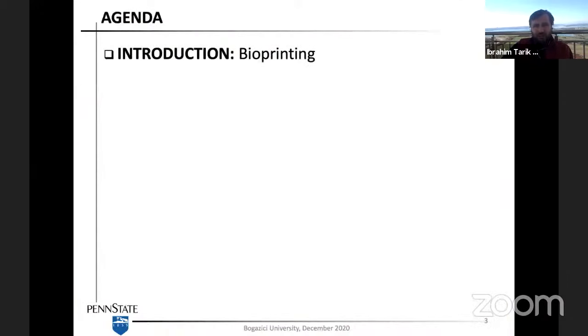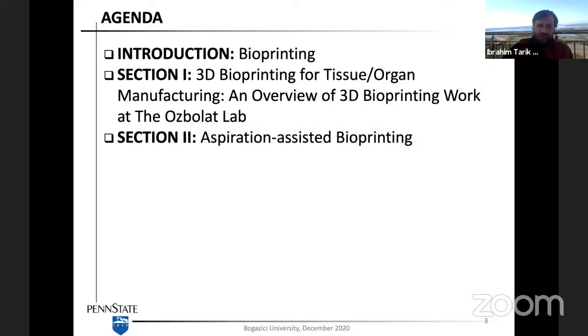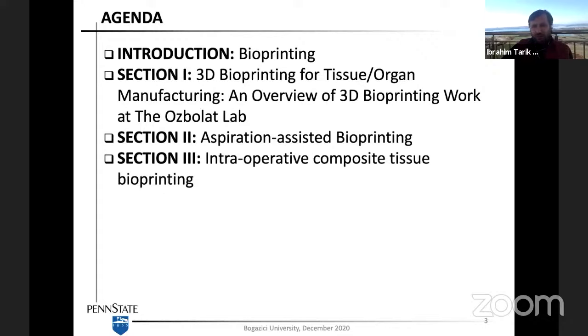So today, here is the agenda for my talk. I'll start with bioprinting, with a very brief introduction. Then I'll talk about the overview of the 3D bioprinting work going on in my lab in the last 10 years, since 2011, when I started my lab at the University of Iowa before joining Penn State. Then I'll talk about the aspiration-assisted bioprinting technique, which is a new technique for precise positioning of tissue building blocks. And then finally, I'll talk about intraoperative tissue printing, so printing directly on a defect in a surgical setting. A couple of years ago, I was invited for a talk at Boğazici University, where I talked about the intraoperative tissue bioprinting work in detail, but I'll just briefly discuss our recent progress with this technique.